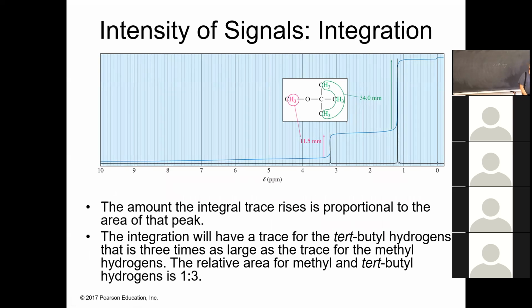Okay, intensity of signals. The more protons we have in a group, the more intense the signal will be. Okay, so here again is methyl tert-butyl ether. And you can see that the tert-butyl protons give a signal that's taller than for the methyl protons.